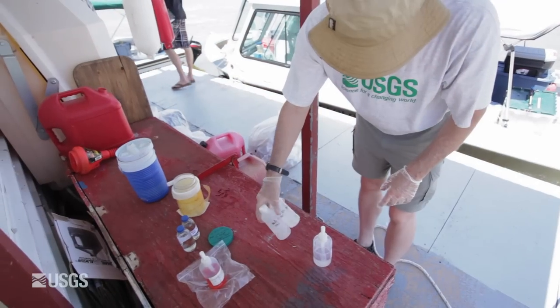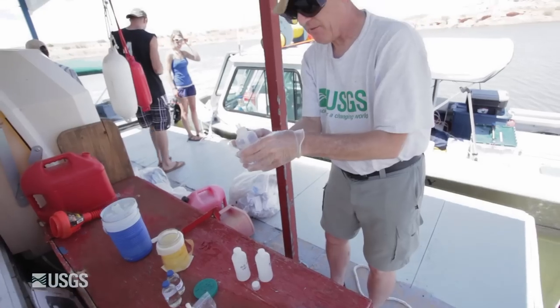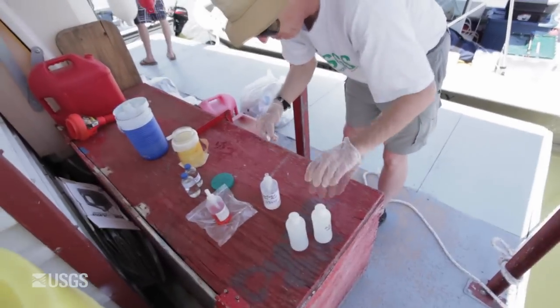The metal samples need to be preserved with nitric acid. All of the samples will get four doses, or about two milliliters. The two metal samples are now preserved and ready for analysis.